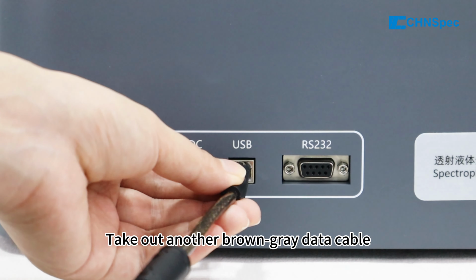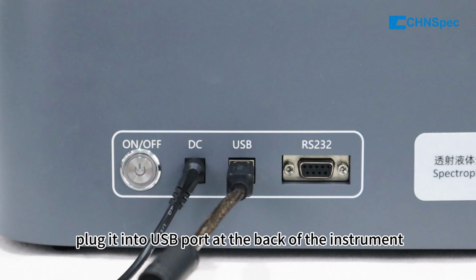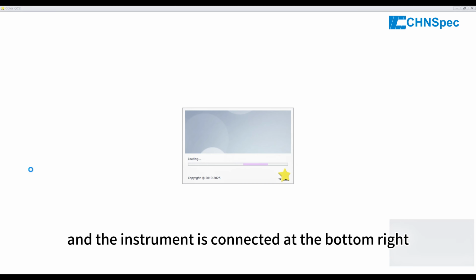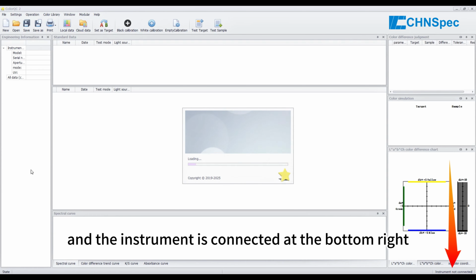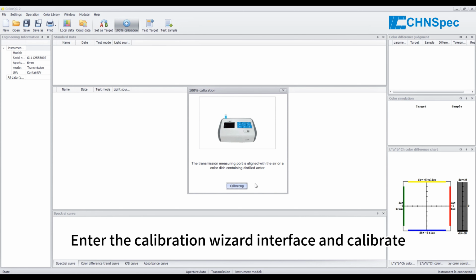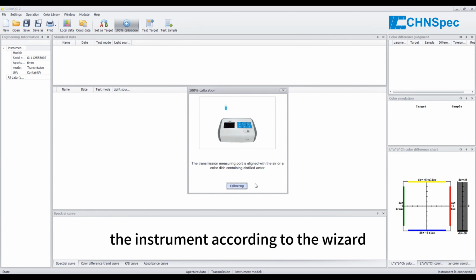Second, calibration. Take out another brown-gray data cable, plug it into the USB port at the back of the instrument, and connect it to the computer. Open the QC software, and the instrument is connected at the bottom right, which means the connection is successful. Enter the calibration wizard interface and calibrate the instrument according to the wizard.